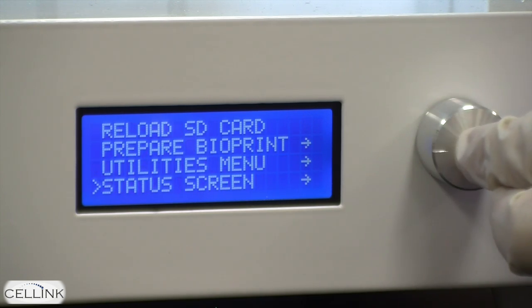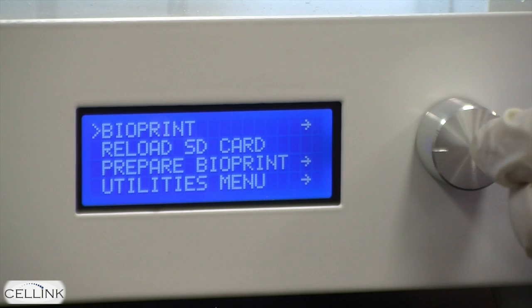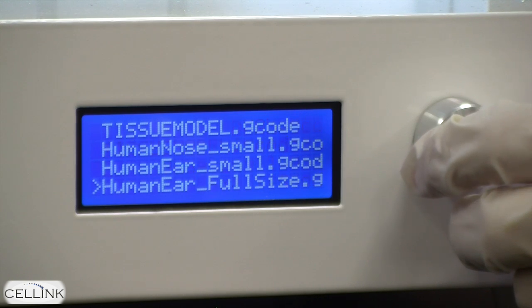Finally, you have the option to return to the status screen, which will keep track of the print speed and the amount of time until printing is finished while you are bioprinting. In addition, in the bioprint menu, you're allowed to select which file you'd like to bioprint.